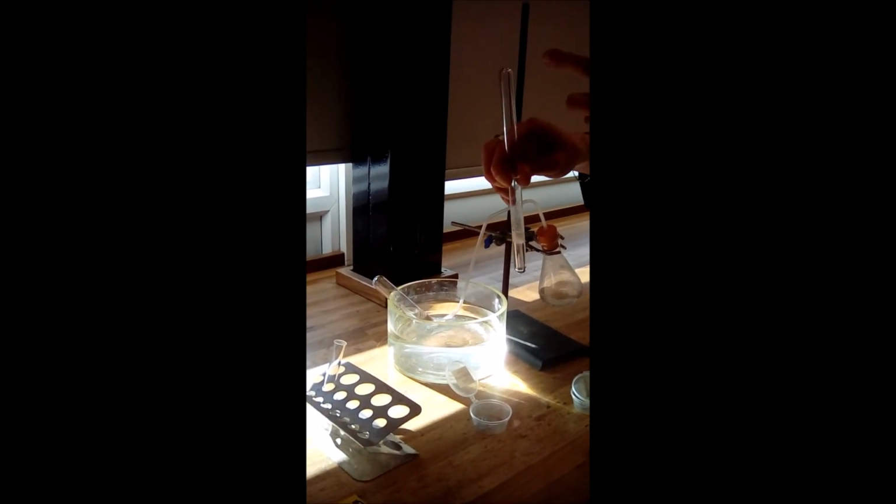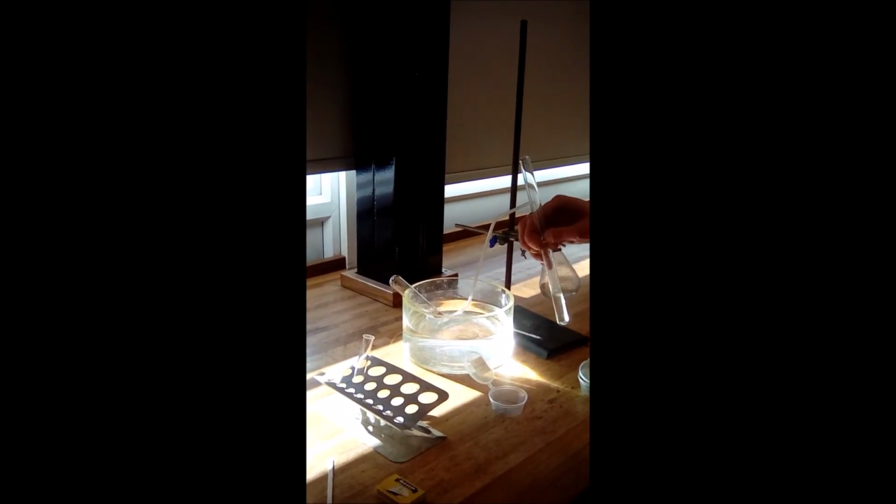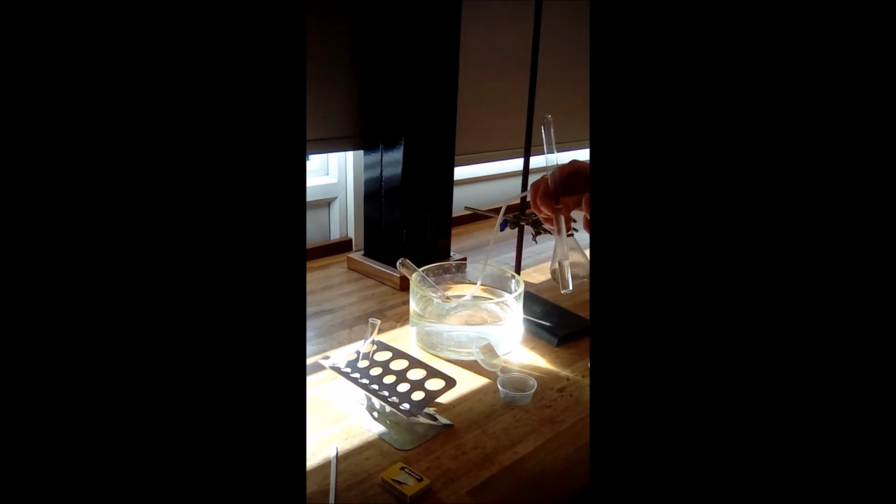Okay, so this is the Squeaky Pop Test, we sometimes call it. But don't just write Squeaky Pop Test in the test. What you'd actually need to write is that the reaction produces hydrogen, and then to test for hydrogen, we then put a lit splint in the mouth of the test tube, and it will make a squeaky popping sound.